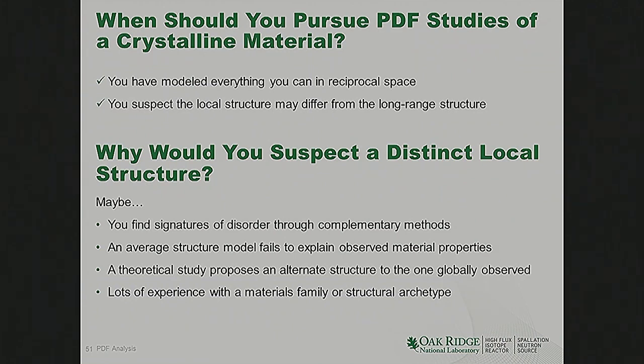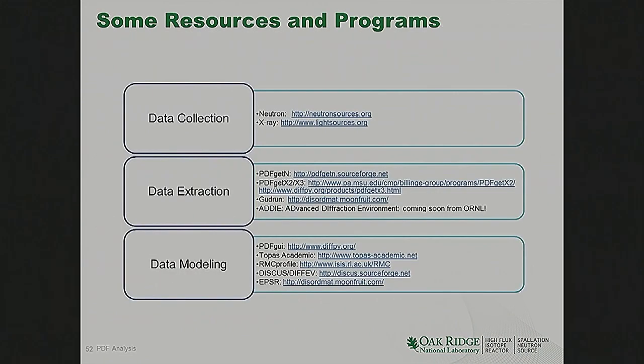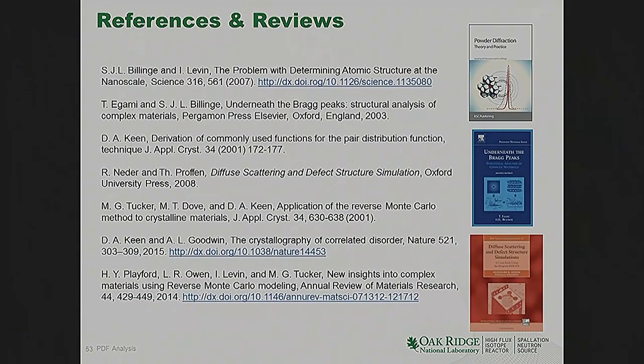And maybe it's because you have lots of experience with a materials family or structural archetype. So if you know that you have a frustrated lattice somewhere, it would make sense to go do a local structure study. And I've provided for you, I won't read through this for sure, a bunch of resources and programs you can look at to find more, and suggested a few references and reviews.